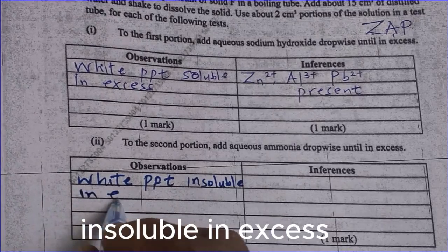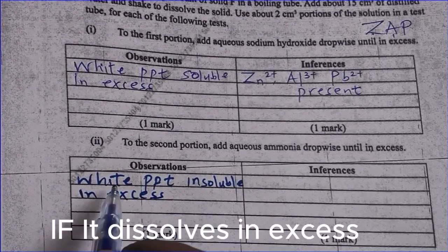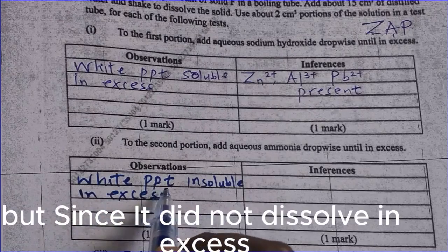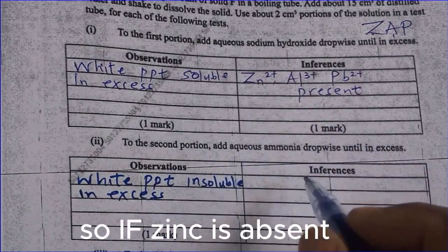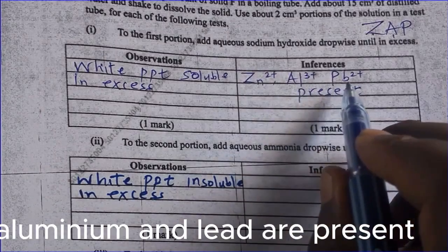Insoluble in excess. If it dissolves in excess, then zinc is present. But since it did not dissolve in excess, then zinc is absent. So if zinc is absent, what could be present? Aluminum and lead are present.